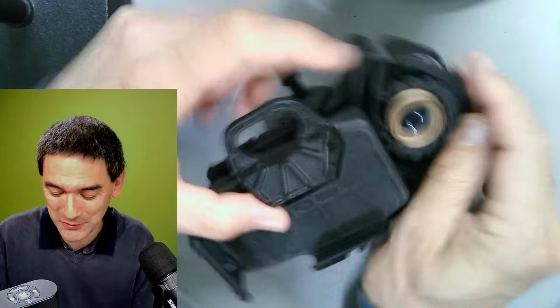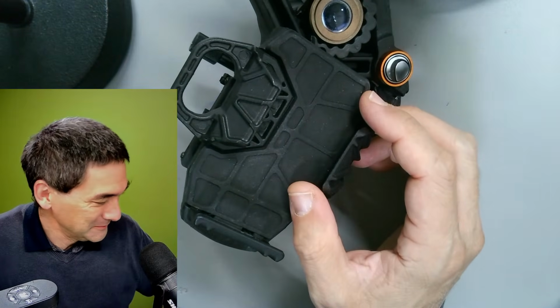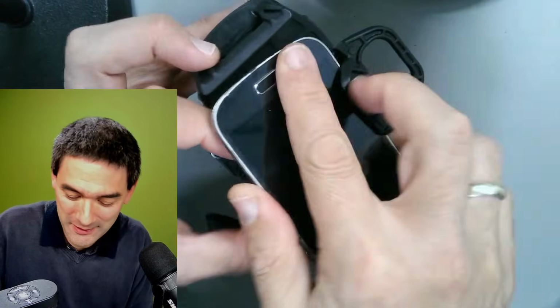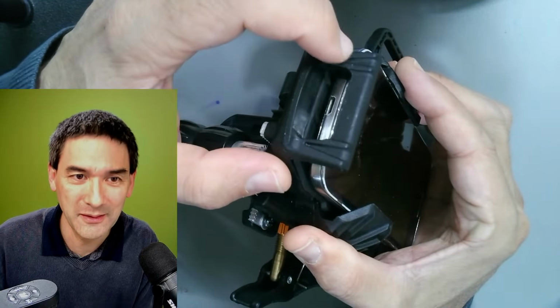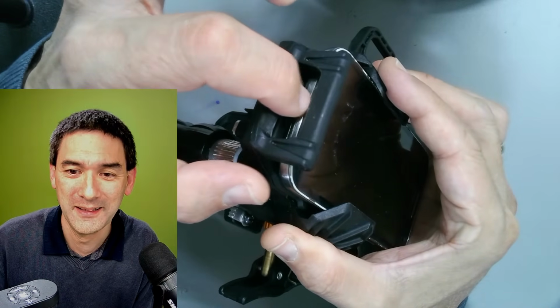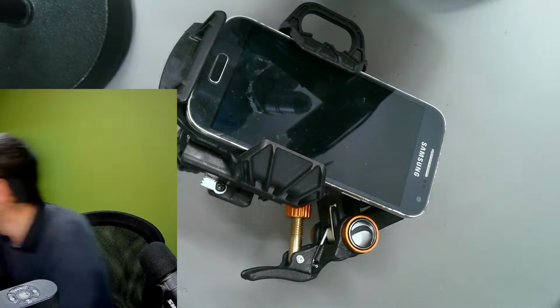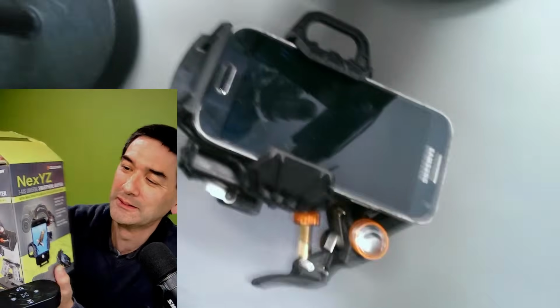The mobile phone goes in here at the top. It goes like this. Look, the people who designed this actually were thinking, because they made a little hole here so that you can put a cable in here. Yeah, that's the Celestron one. That's correct. I'll show you the box. Just a second. I've got the box on the floor. That's the one here. It's a huge one.